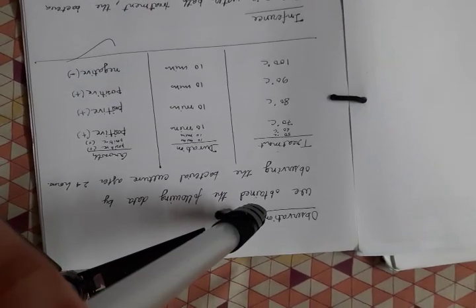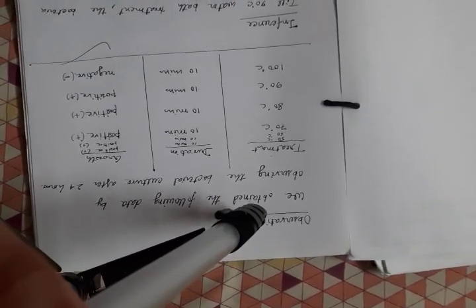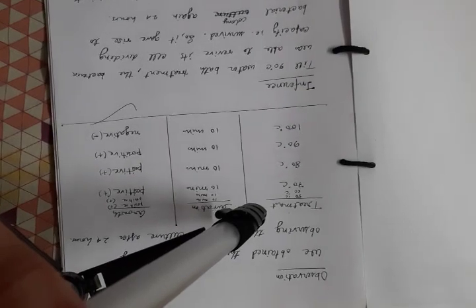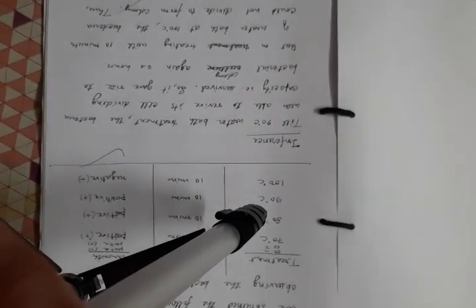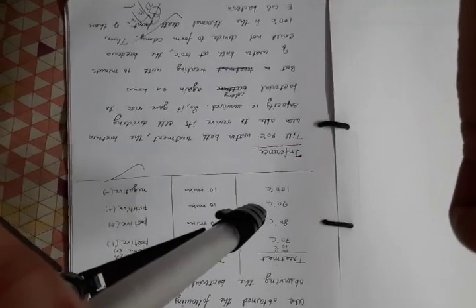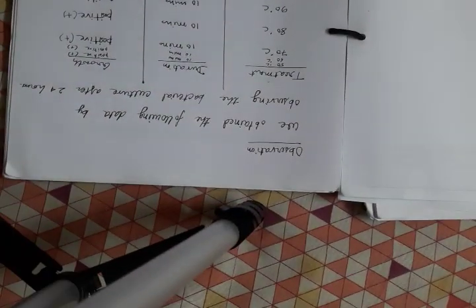So the 100 degrees Celsius must be the thermal death point of this bacteria. That was the inference of the experiment. That's it.